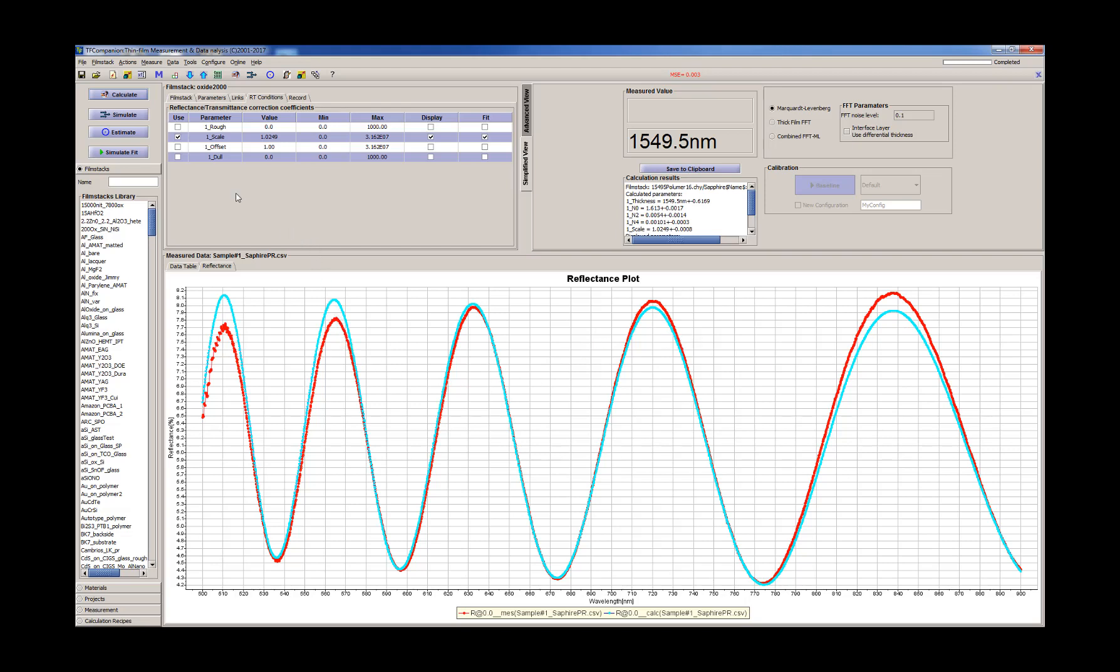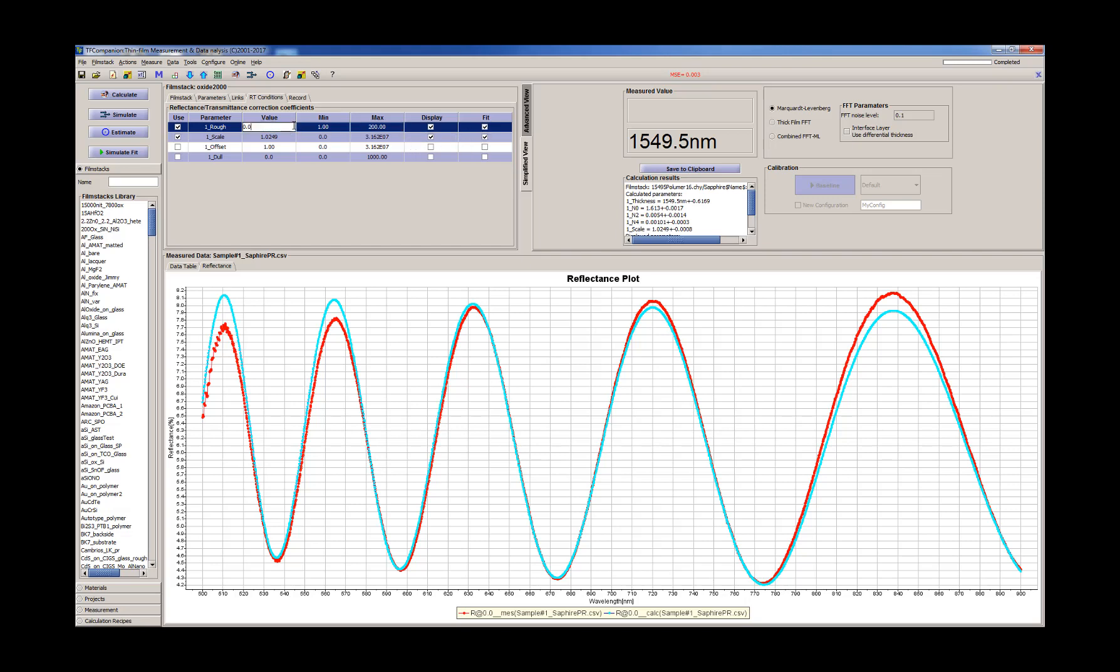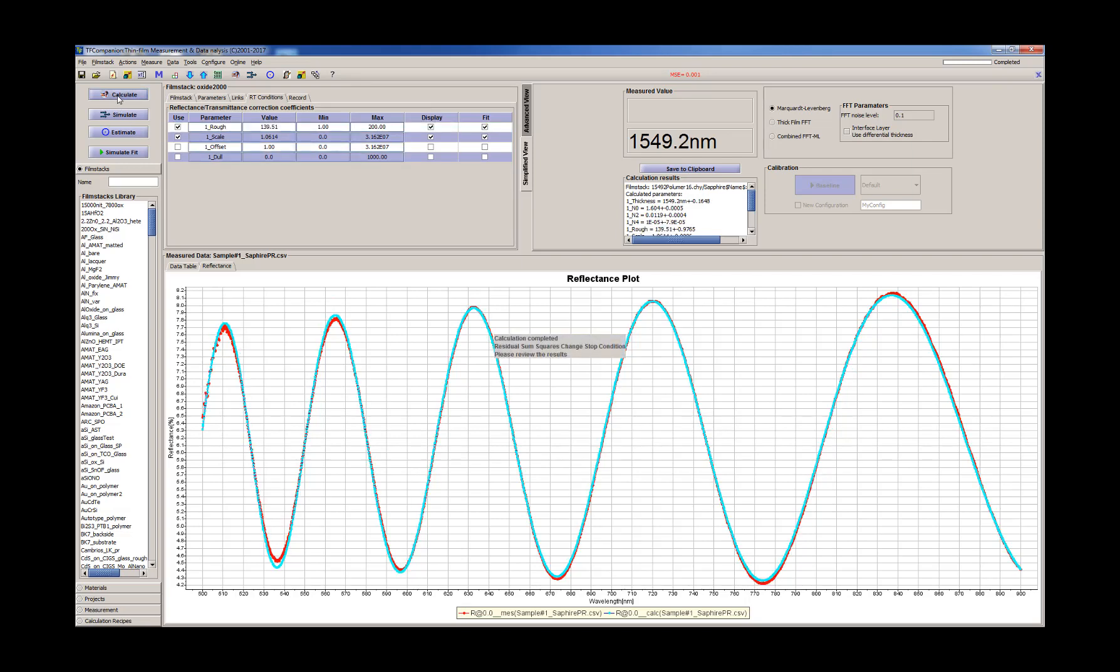So what we want to do is to add roughness parameter. We always want to put minimum at least one. We don't want it to go crazy, so we'll limit it to 200 angstroms. Let's say starting value about 10 and calculate again.